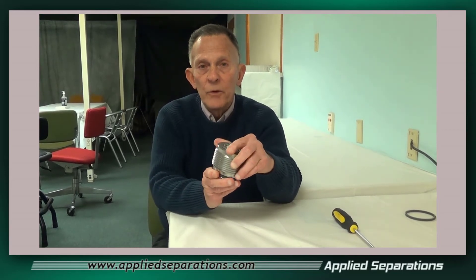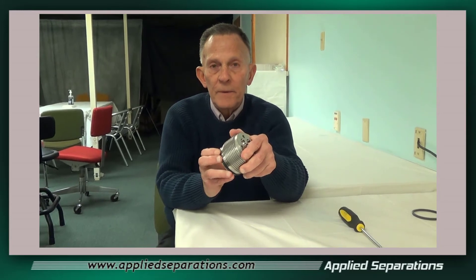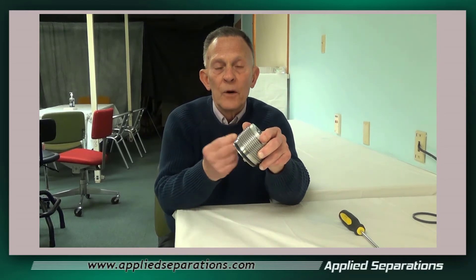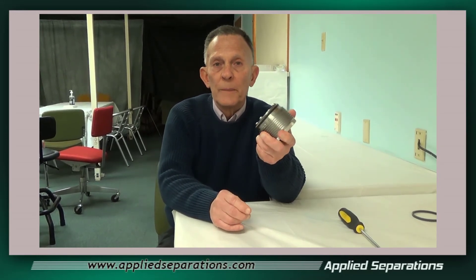If you'd like to make this lip compress easier, you can put a little bit of water around it for lubricity. Then you can screw this into your vessel and you should have no problems using this new cup seal. It should last just as long as our normal cup seals.